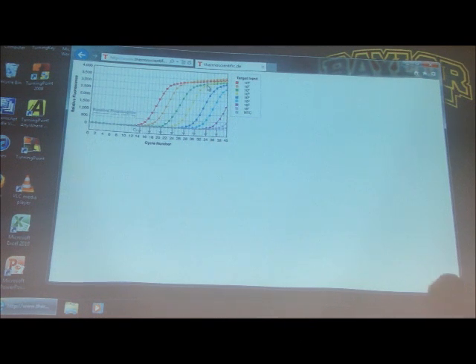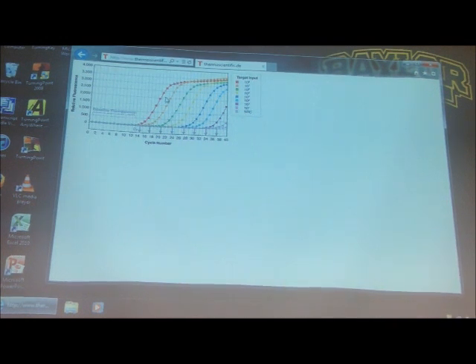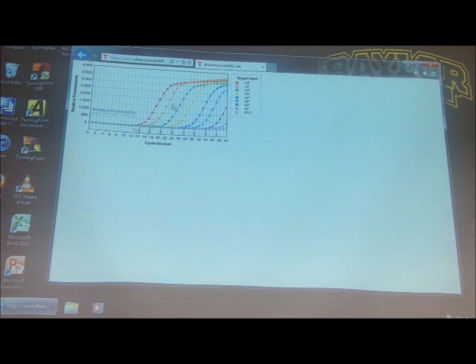Okay. All right. So with qPCR, we're going to measure this amount. You can see here that the target input, the one in red, is 10 to the 8th mRNA molecules. The one in orange is 10 to the 7th, and 10 to the 6th, 10 to the 5th, 10 to the 4th, 10 to the 3rd, and then just 100, and then 10 right here, and then no molecules at all. And you can see the cycle number here, and right here is where we're going to do our reads.